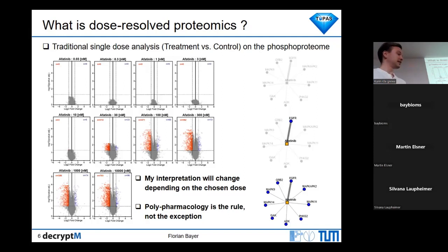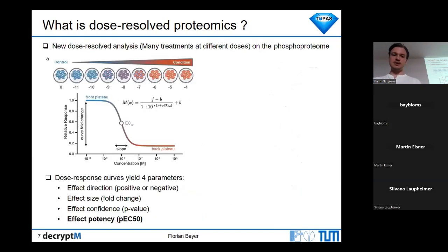So this is the reality, and I think also in the literature there are many falsely reported effects just because people use high doses and then misinterpret their own data. But we thought that we can actually use this to our own advantage, and how we do this is we just appreciate that there are these different affinities to different protein kinases.